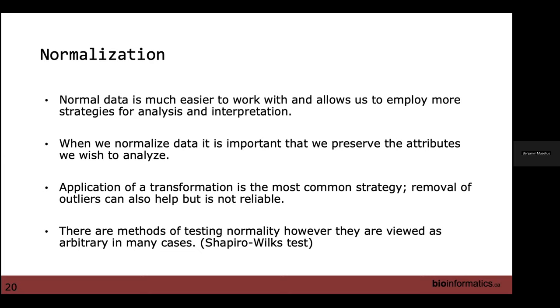Throughout these lectures, we heard a couple of times, try to run this way and then change the parameter and see the result. So can the change of parameters be considered as another testing? For example, we have 5,000 proteins, we have 5,000 hypothesis tests, but on top of that, we have different parameters. Is it the same thing or completely different?